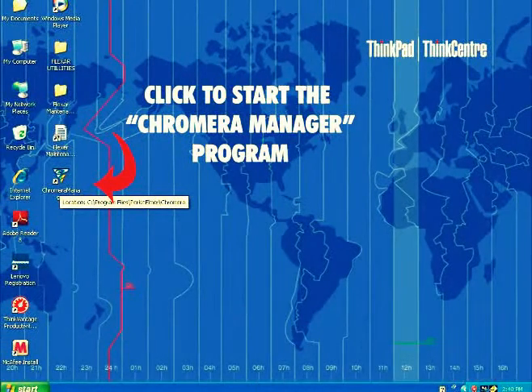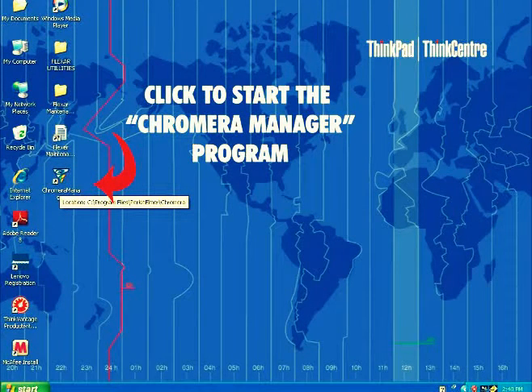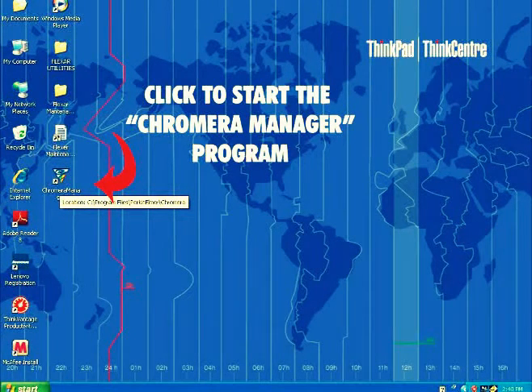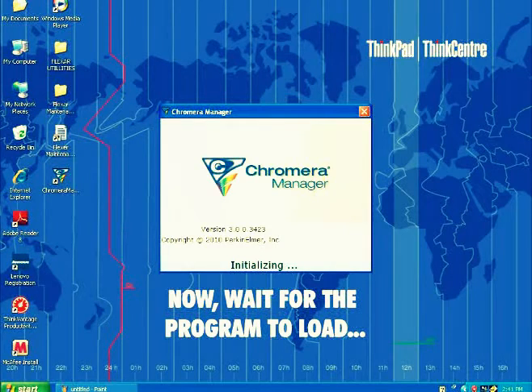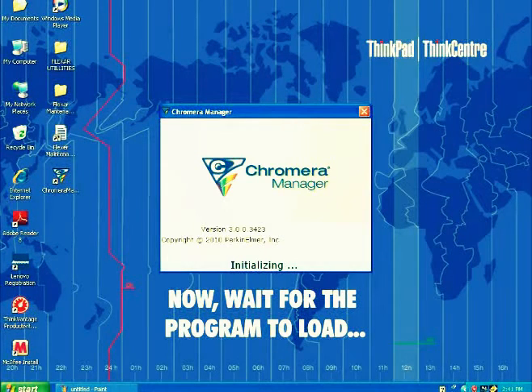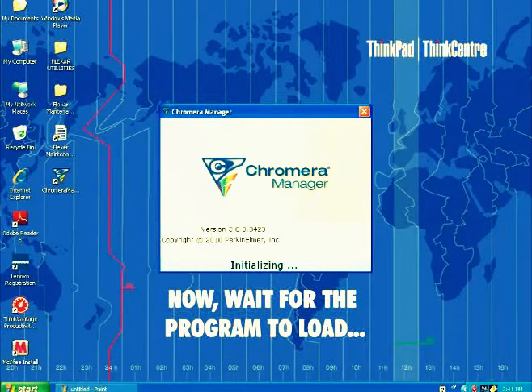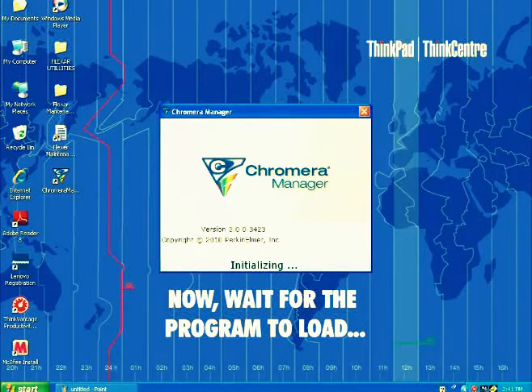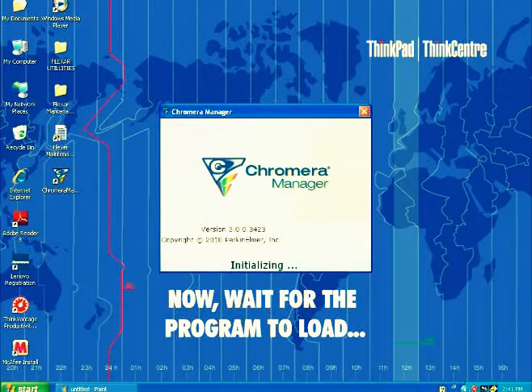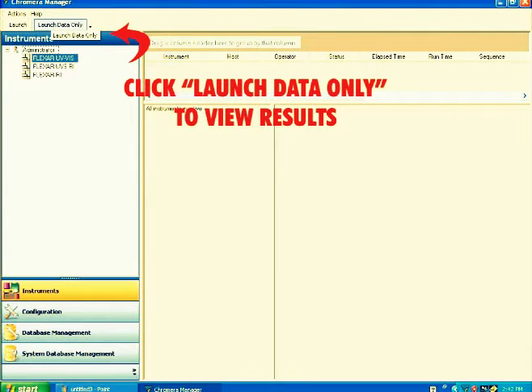On your desktop, click the ChromeRAW manager program. This icon will show up indicating that the program starts initializing. Just wait for the program to load. Then this will appear. Under the Control menu, click Launch Data Only to view the results.